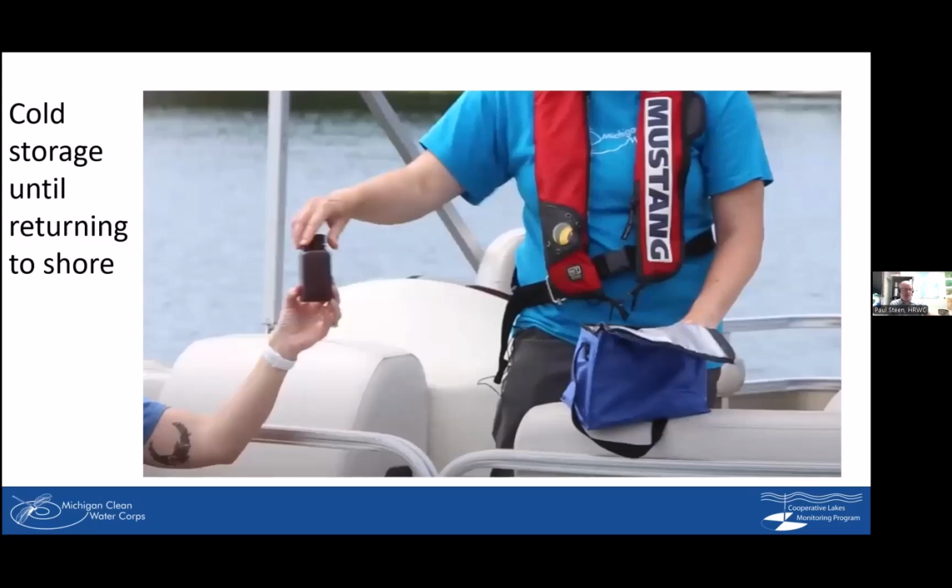And then you take both of your bottles and you put them in your cooler, which you should have ice with you. You're also putting your phosphorus samples in your cooler, for example, and you're done. You bring that back to shore.